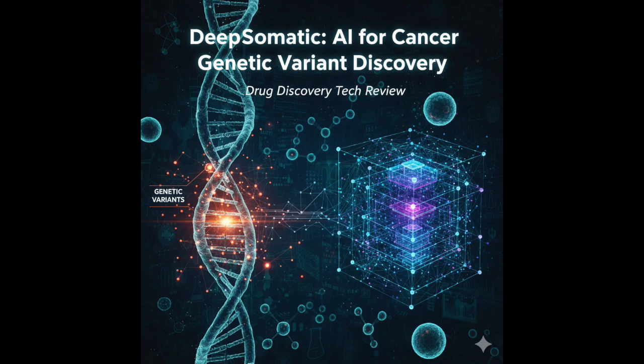Yep. And the aligned reads from the matched normal sample, assuming you have one. We'll get to tumor-only later. Okay, normal BAM CRAM. And third, you need the reference genome sequence, usually a FASTA file, so it knows what the normal sequence is supposed to look like at any given position. Got it. So what does make example somatic do with these?